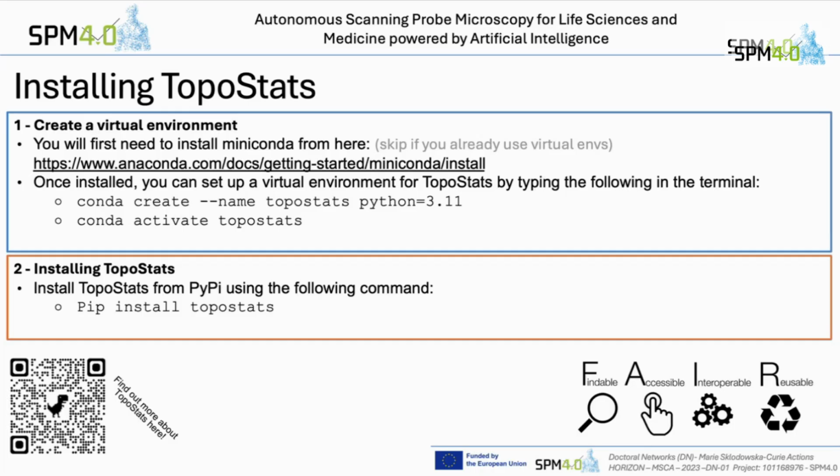No, we just find the packages that it needs. It's the most stable.